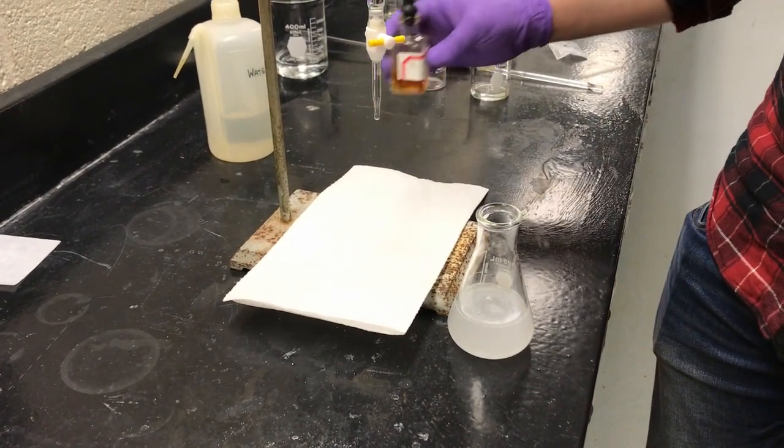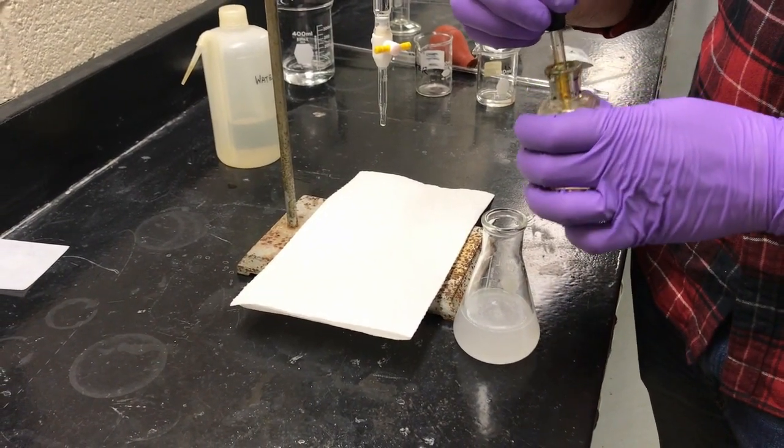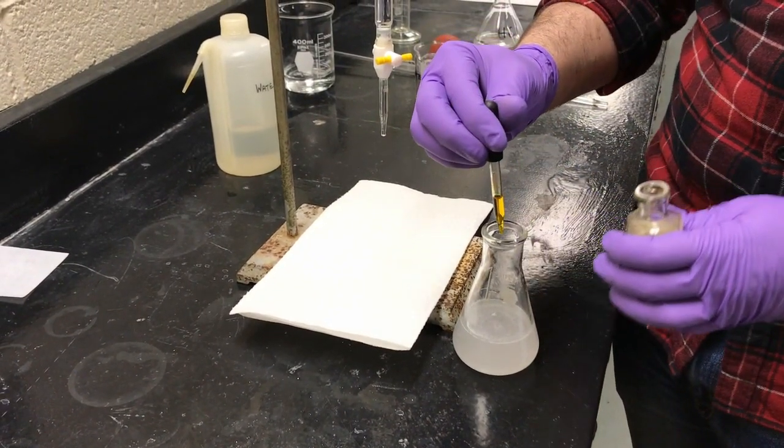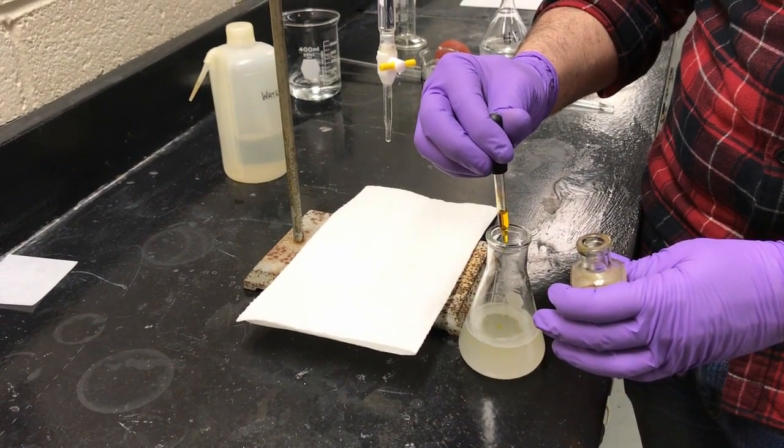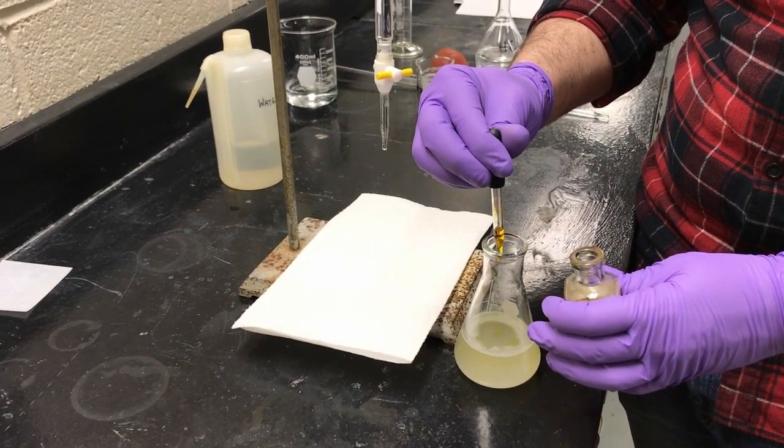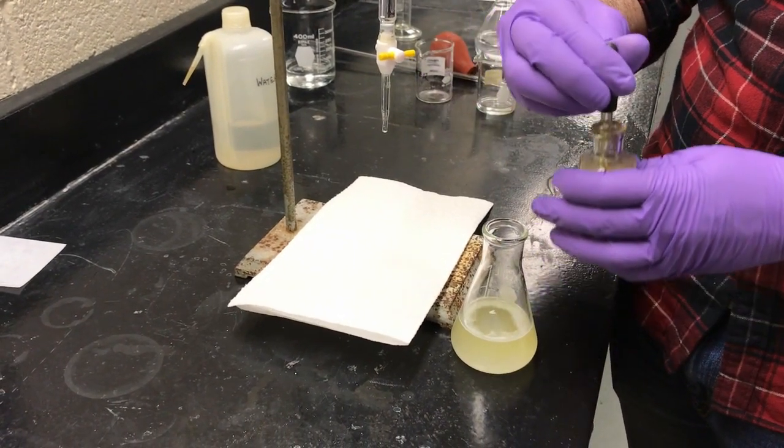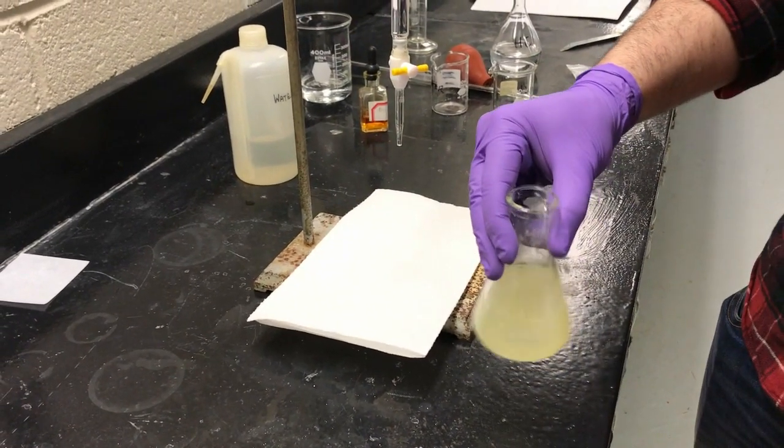So we're first going to need our indicator before we titrate. We're going to use bromothymol blue. We're going to add about 10 drops. So 1, 2, 3, 4, 5, 6, 8, 9, 10. We're going to swirl it a little bit.